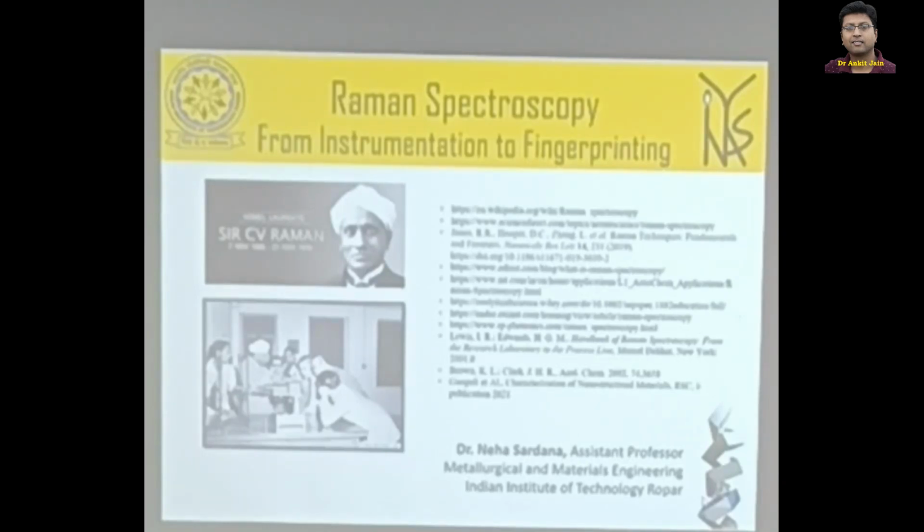So you are the future of our research and I hope we can inspire some of you who are sitting here today and maybe you are inspired to get a Nobel Prize. Well, Raman spectroscopy, as the name suggests, was actually invented by Sir C.V. Raman, and that is way back in the February month of 1928.